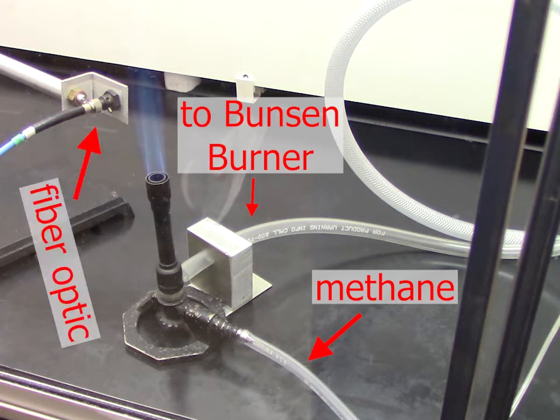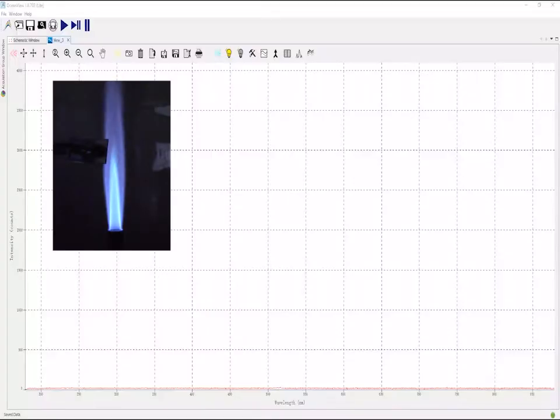We'll then use this fiber optic cable to transmit any light that may be emitted from the flame to the spectrophotometer. We're not going to need to do much setup on the UV-Vis spectrometer software. However, like the last lab, we will need to save all of our spectra. If you forgot how to save your spectra, please refer to the video from the last lab.